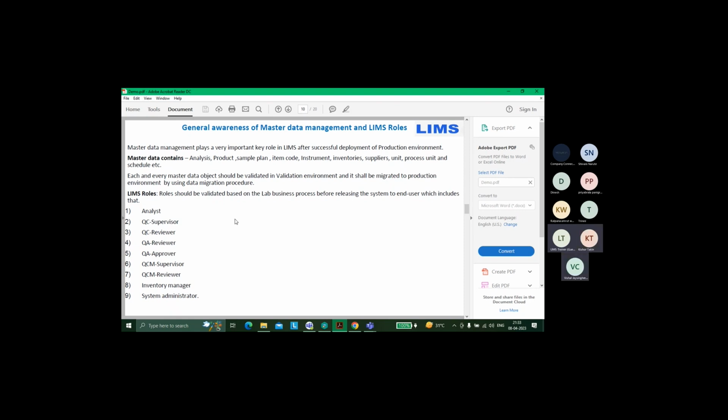Because we are working in a controlled environment, right? LIMS is a controlled environment. You don't need access to those things on which you don't need to work. If you do something wrong, you need to work on only your task. If you're an analyst, go only to the samples, assign values, work with the values, or change the values if needed with proper justification. But you should not be able to approve them. Your supervisor, whoever is senior in your chain, will come and approve or reject. Or you won't be able to change your LDAP password.